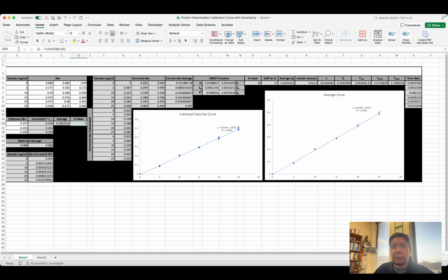Just so that you remember, this video is intended to be watched after you watch the analytical chemistry video on how to calculate the different uncertainty parameters, like uncertainty of X, uncertainty of Y, uncertainty of B, and so on, by hand. At the end of that video, I also taught you how to do it in Excel. So if you're unsure of any of the equations I'm using, or wondering where these numbers come from, make sure you refer back to that video. I say that now because that's where the K value comes from, the number of replicates or trials. The K value is in the equation for the uncertainty of X, so if you don't remember that equation, go back to that video or refer to your instrumental analysis notes.